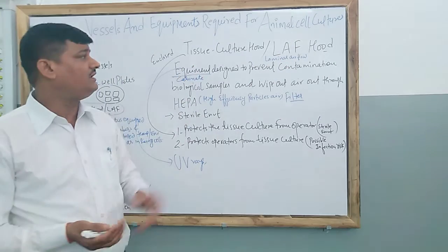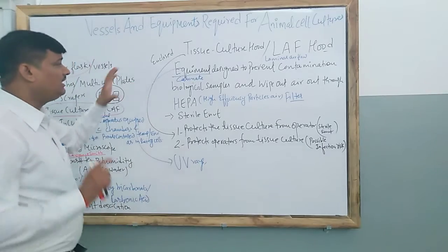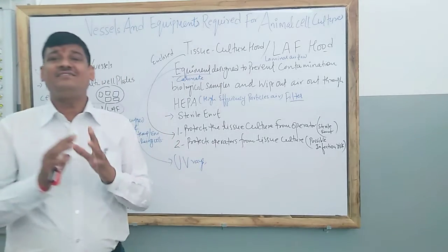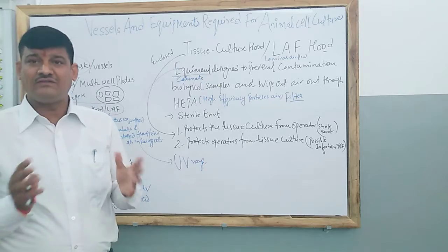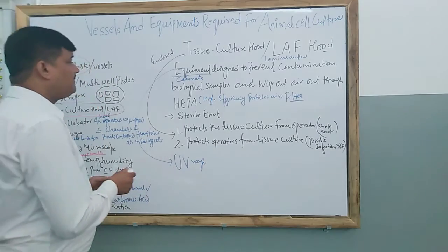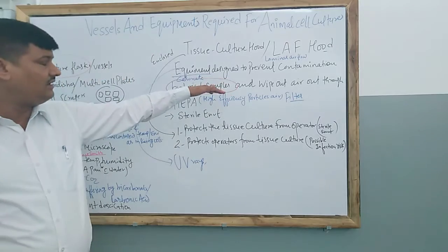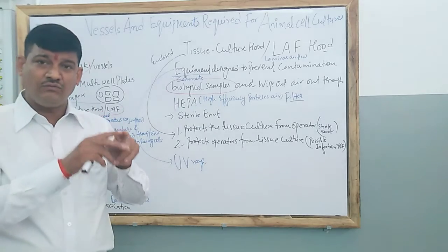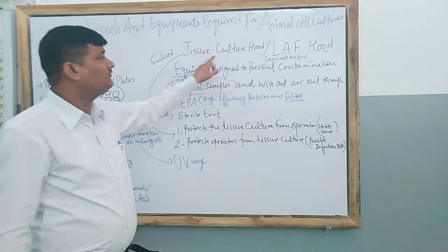So the tissue culture hood is also known as the laminar airflow hood. And what is this tissue culture hood? It is a well-equipped enclosed cabinet, or you can say an equipment designed to prevent contamination of biological samples. Biological samples means the cells which are taken for the purpose of culturing. It also has some devices kept inside the hood, whose main role is to wipe out the air from the culture vessels or from the tissue culture hood.